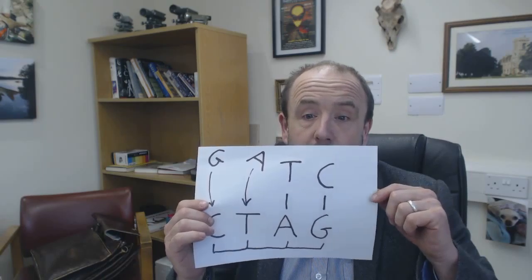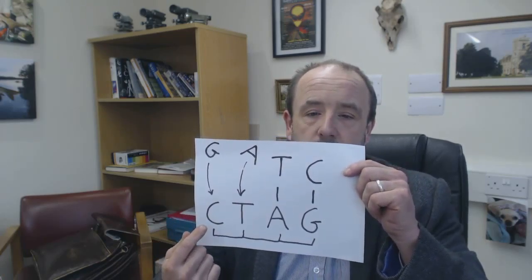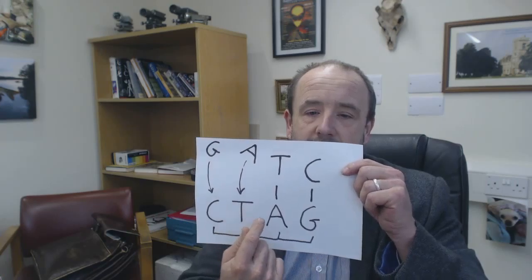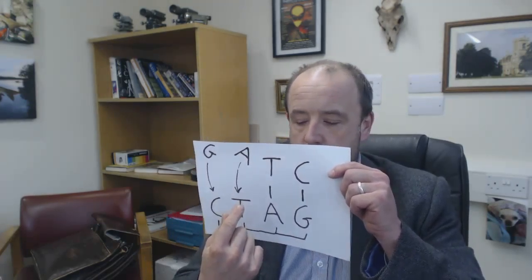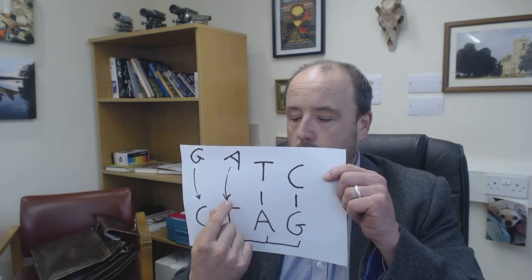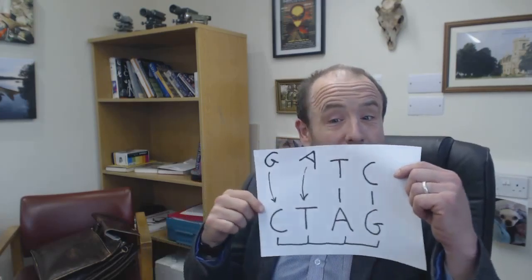Ultimately, DNA sequencing is very similar to the PCR reaction, and it's based on the fundamentals of complementary base pairing. So here we have a short DNA sequence, C, T, A, G, and whenever there's a C on one side of the molecule, it will be joined by a G. Wherever there's a T on one side of the molecule, it will be joined by an A, and so on and so forth.